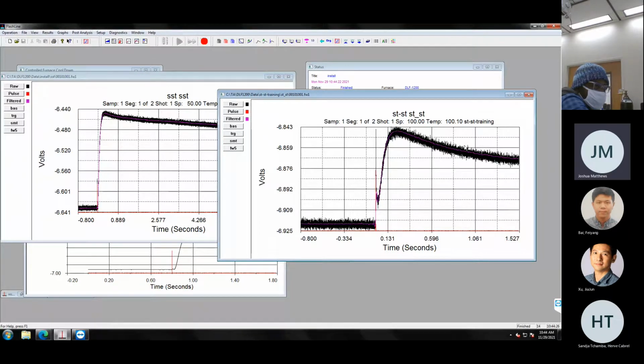Again, for the service group, we look at the reference pieces that we send. Those are typically the only samples that we run, just to make sure that your instrument is working properly and it's not a sample prep problem. So we look at stainless, we look at molybdenum, we have copper. There's a thermographite sample, but those are the ones that we're usually running here.